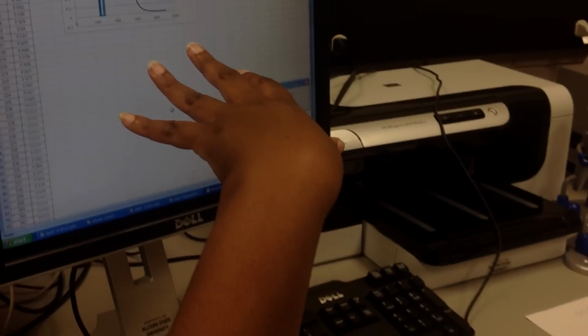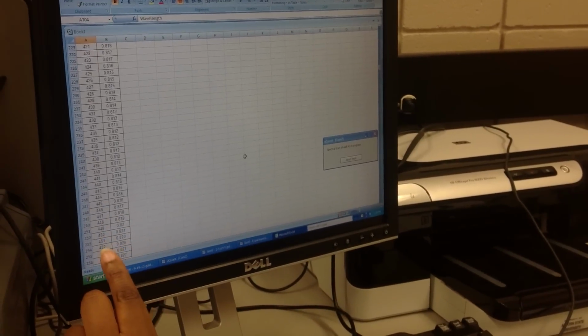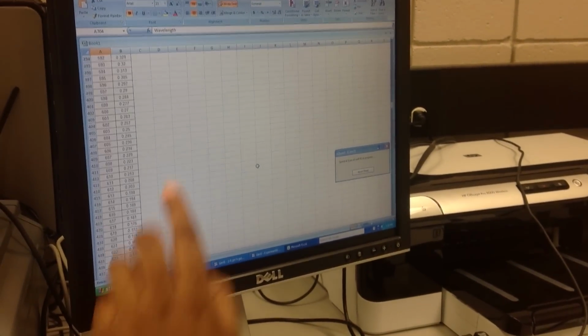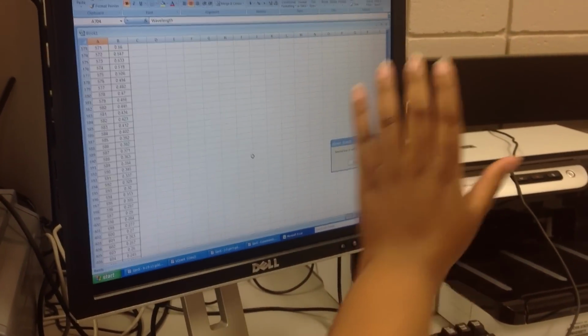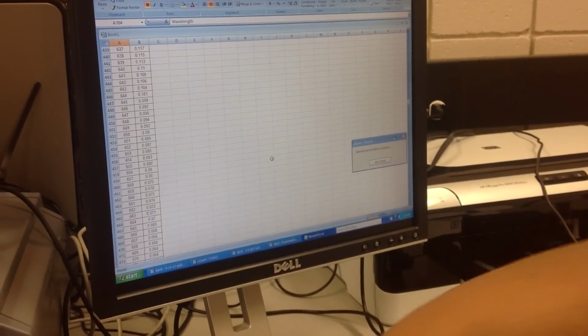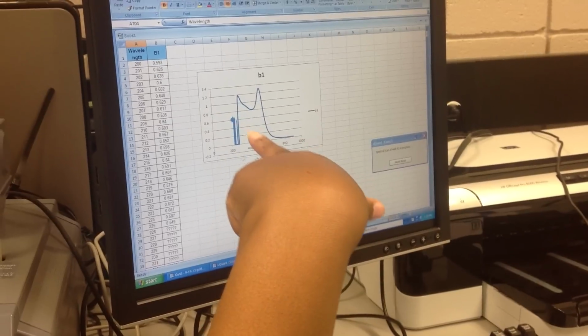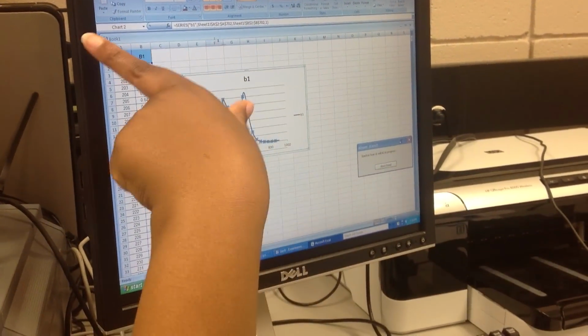And so now what we want to do is add this series to this one. Sometimes when they put it at the bottom, I copy them and make them all side by side because we're using the same set of X values. So now we just go and add a series here. We're going back to our chart, and the easiest thing for us to do is to move this chart.